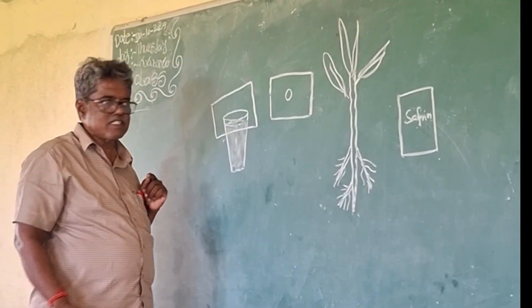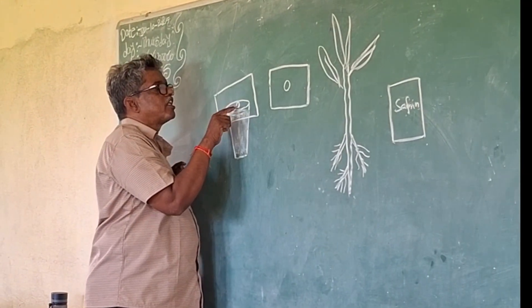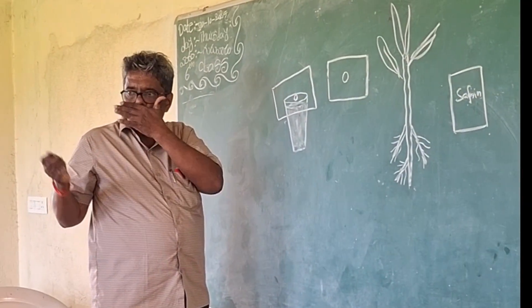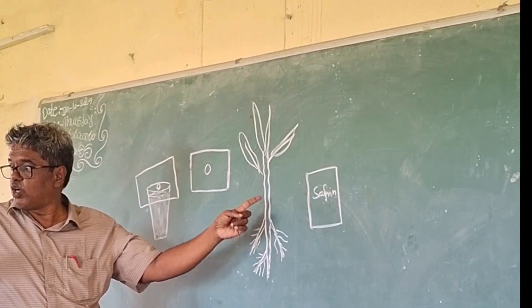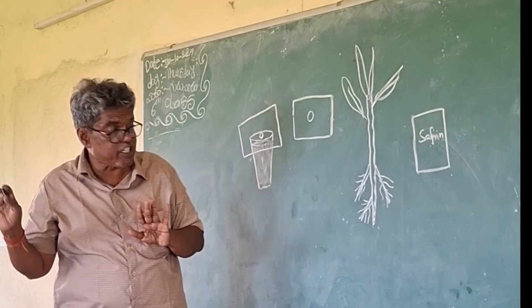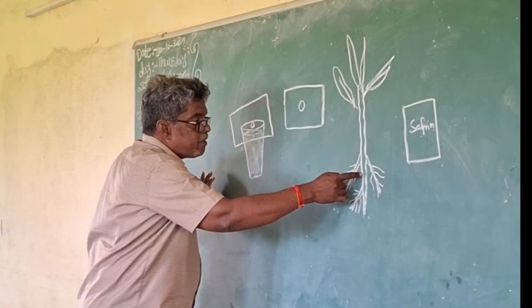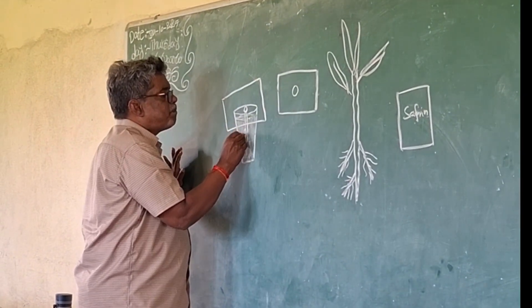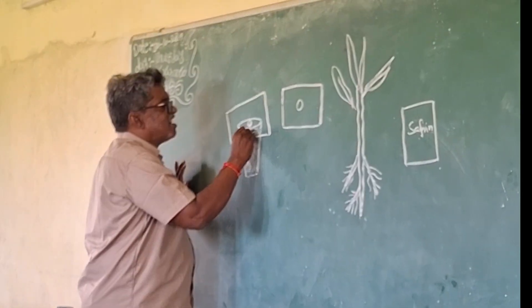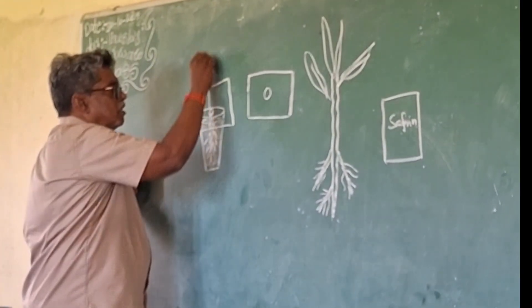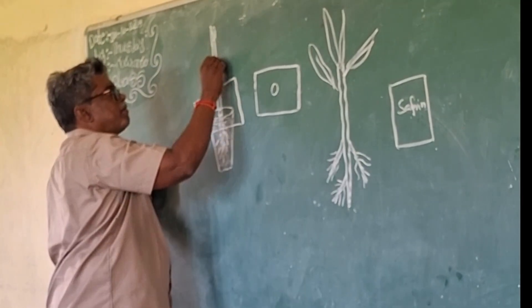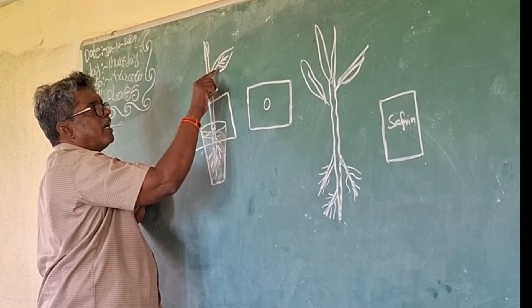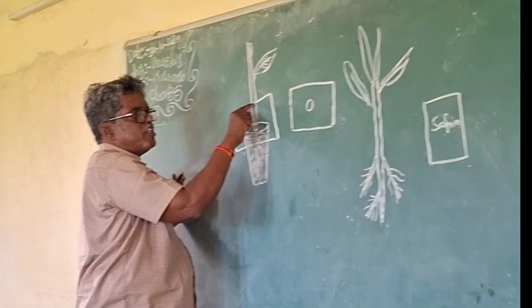Now keep the cardboard sheet on the glass so that the hole comes at the center of the glass. Take the balsam plant — collect a fresh plant, not one collected the night before — and keep the roots totally dipped into the saffron-colored water. Before keeping it, observe the color of the veinlets and stem color of this balsam plant.